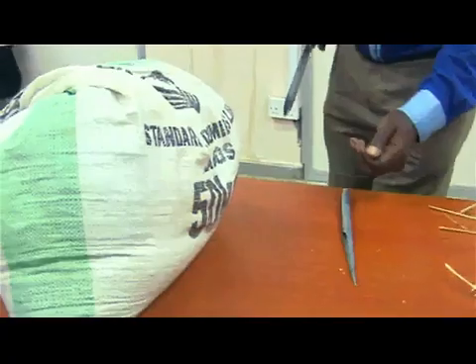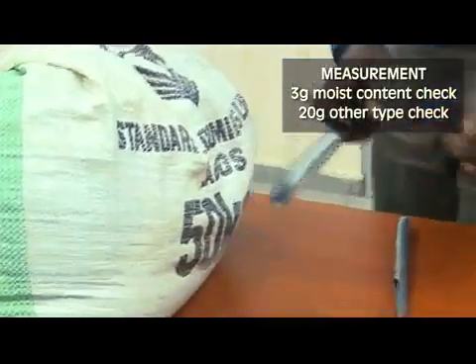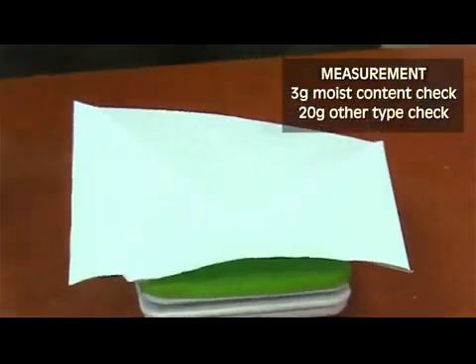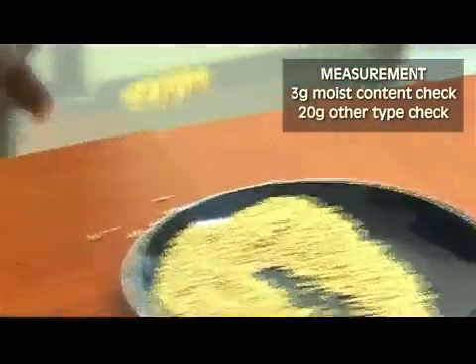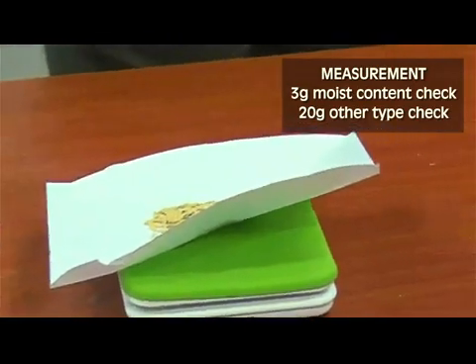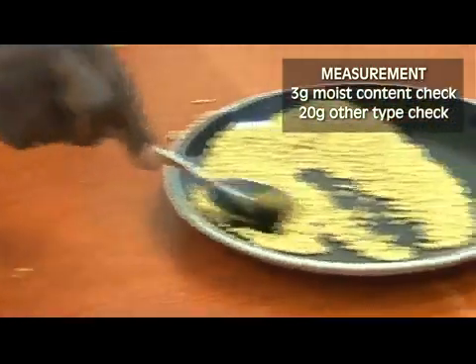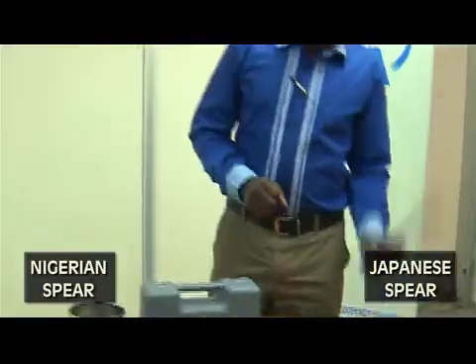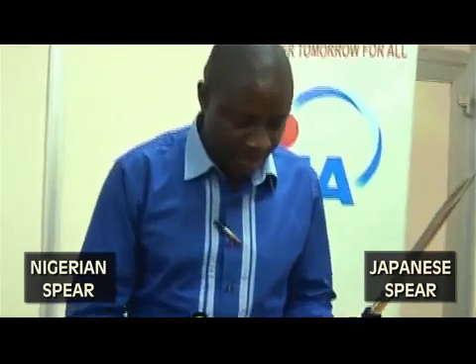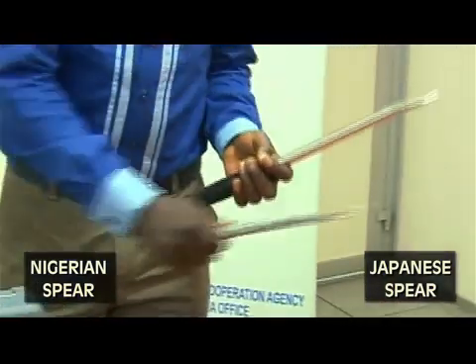Take a random sample of paddy from a lot whose quality you wish to check. Measure 3 grams for moisture content check and 20 grams for other type checks. Use a Nigerian or Japanese spear to take samples from the bag. Do not touch the samples to avoid transferring moisture.